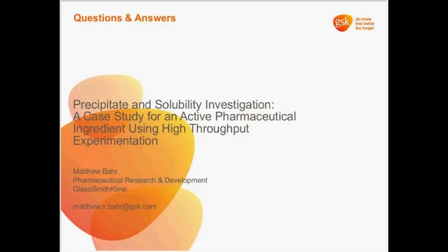But we're really not looking at using this machine as a dissolution apparatus as much as just measuring the solubility. So while we can take short time periods, we have to really keep that realistic, and we probably would only run those with n equals 1 or n equals 2 if we wanted to do it the right way. And then we don't really have statistical significance in our data with so few data points.